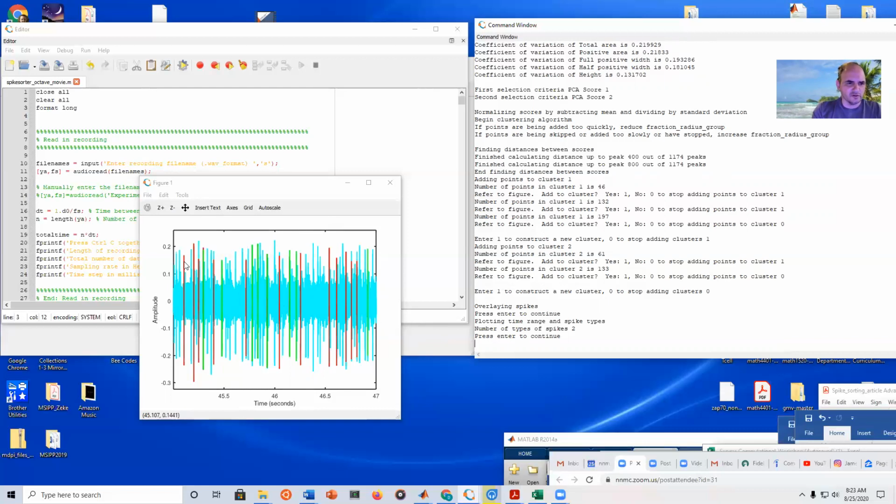Now what the algorithm is going to do is calculate the distance between 2 successive spikes, and that's called the inter spike interval. So we have one inter spike interval here, another one here. There's a red spike here. It's kind of hidden behind the green spike, but there's another inter spike interval here, another one here. So a number of different inter spike intervals can be calculated using the distance between 2 spikes of the same color. And we're going to do the same for the green spikes as well. Then, once we have the inter spike intervals, we can calculate the firing frequency by taking the reciprocal of the inter spike interval.